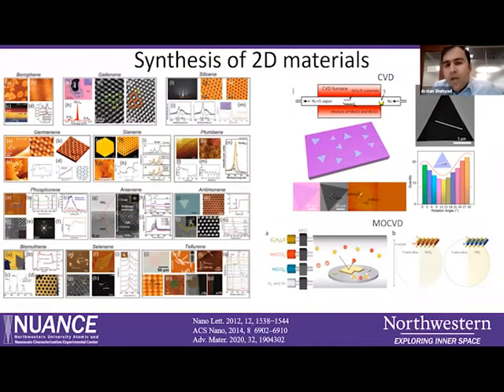One of the concerns is that these 2D materials, from a dimensionality perspective, are just 2D. They do not have a third dimension. When you're talking about 2D, they are literally very thin layers of material sitting on a substrate. So in order to look into some of the important properties of these materials, you have to go to atomic scale resolution, HRTEM, or some of the other techniques which I'll be discussing here. That's why it is very important to have an efficient route to characterize these materials.